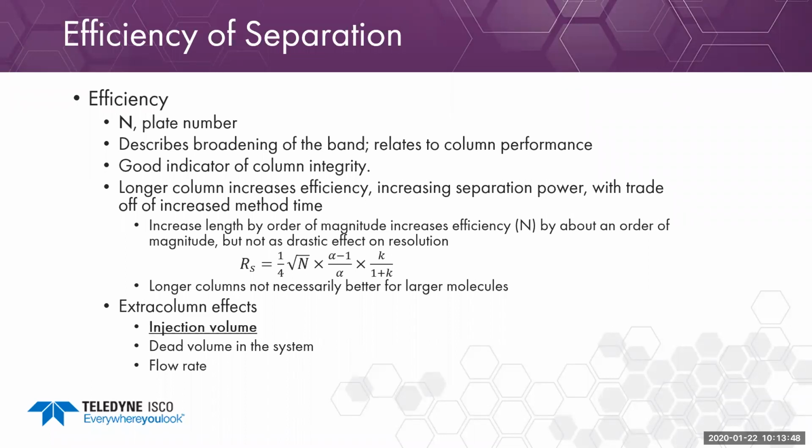As we start to increase, we can increase the flow rate, but we start to deviate a little bit from optimal efficiency numbers, although the particle size is kind of forgiving for that. So we can go ahead and increase that as long as we don't have limitations with back pressure.